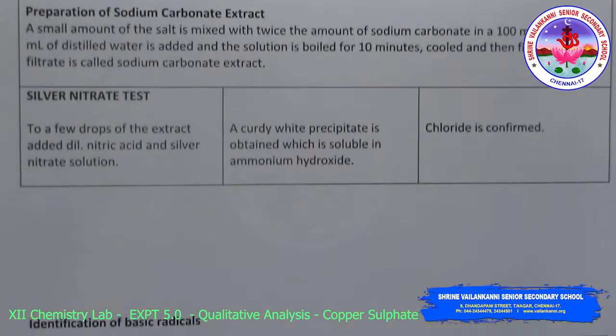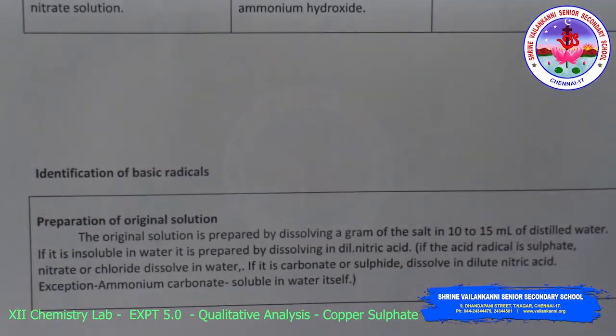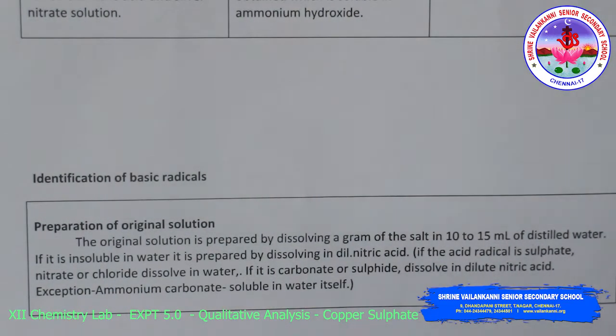Then identification of basic radical, preparation of the original solution. Already I said how to prepare the original solution: add some amount of substance to water, and that is called the original solution.